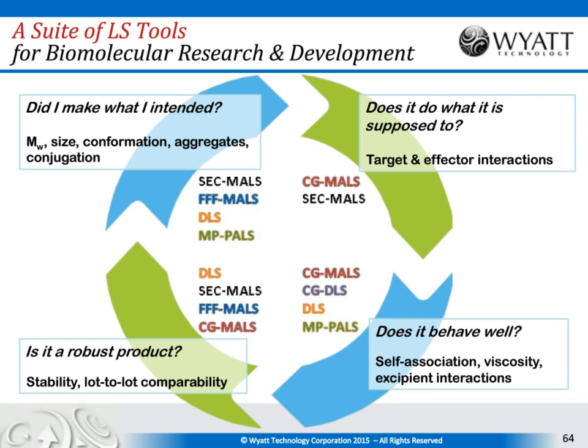Now, Dan, what if you have fluorescence in your sample? Does this affect the results? The listener is specifically referring to measuring particle size using DLS.